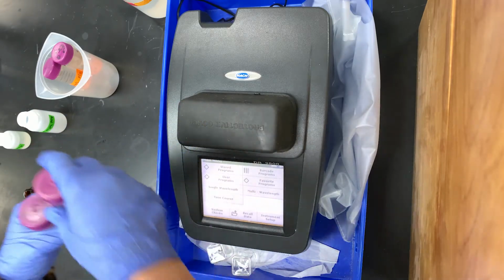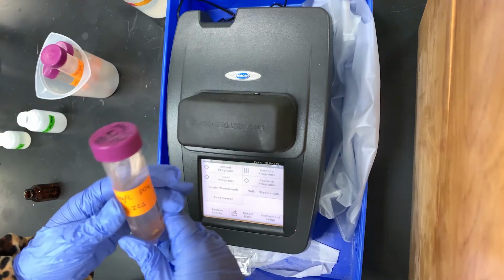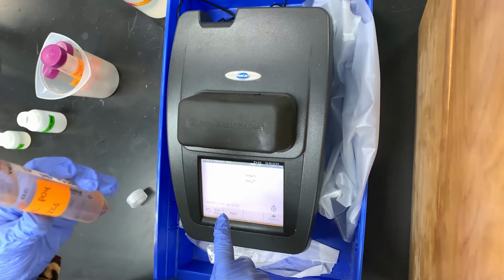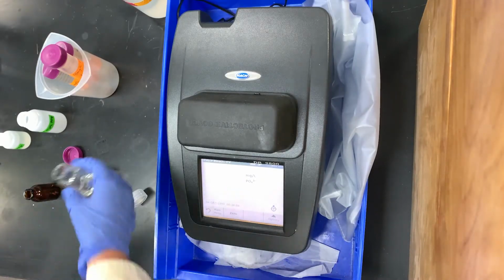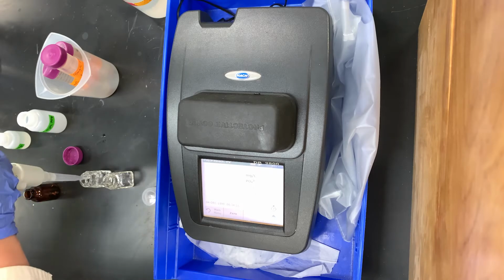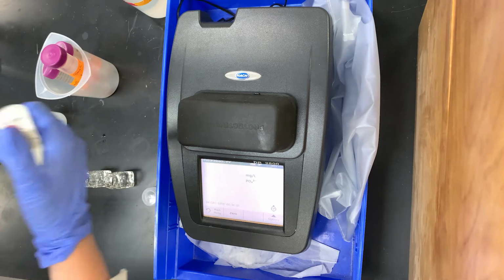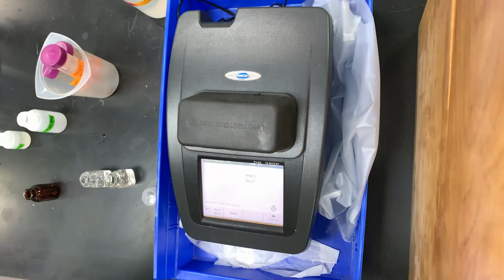Now that these phosphate solutions have been left to adsorb onto the iron-coated sand for the 24 hours, we can analyze the final concentration of each of these solutions to see how much phosphate was adsorbed onto the sand. So I'm just going to speed through these analyses again, and we'll go ahead and choose the same program on the spectrophotometer for the 2.5 milligram per liter phosphate method, and we'll start with our 1 milligram per liter standard. So again, I'm just adding 10 mils of the sample into each cuvette.